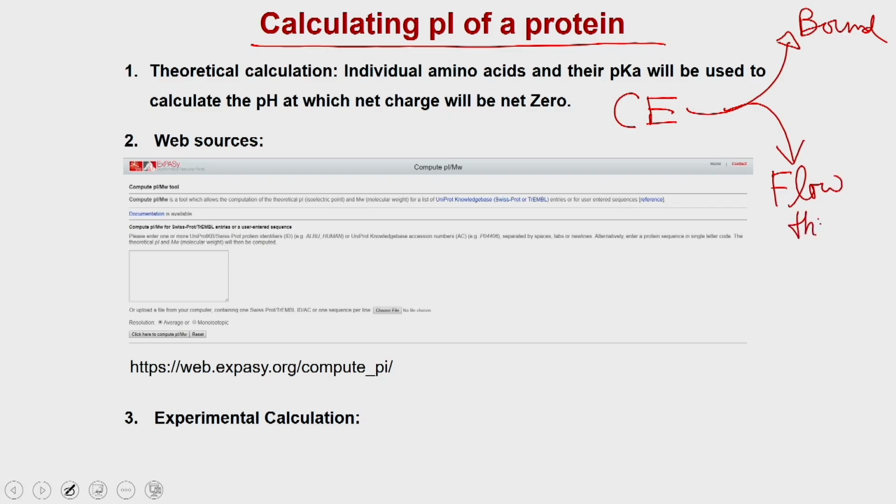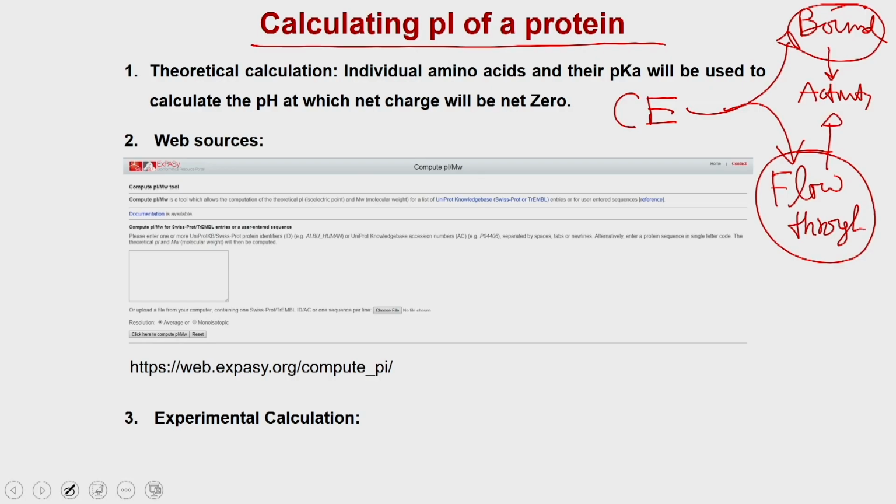Since the genomic era was not there, suppose you are purifying an enzymatic activity, what they were doing is assaying the activity in both of these fractions. Suppose they have done the cation exchange chromatography at pH 7.4, which is a standard thing, because 7.4 is a physiological pH.